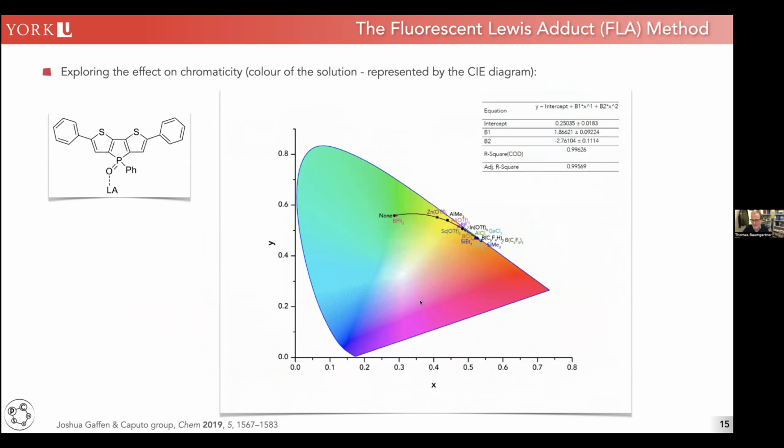It's a chromaticity diagram. The colors in this parabola here, this is all the colors that we can see with our naked eye. And the lighting industry has found a way to actually make this easy to read in terms of coordinates. So you can see here we have an X and a Y axis. And basically, you can define any type of color that we can see with our naked eye by a specific X and a Y coordinate. And that's basically the saturation and the hue of our solution. And an interesting thing that we noticed, in particular, Josh Gaffin here was a postdoc who actually had a minor in math.